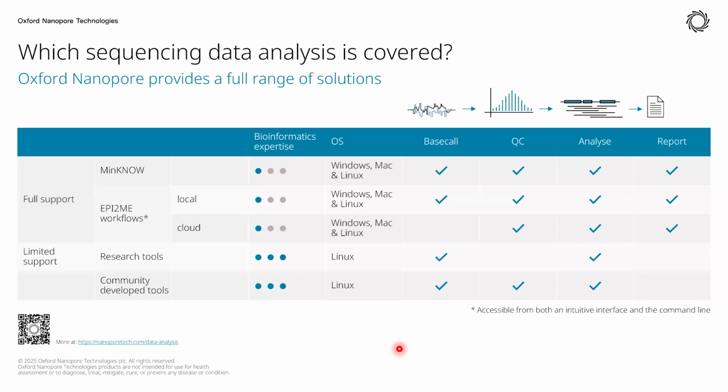So what is the software that we have to run on the raw data in order to know that Chris has these cells and these counts for these genes? This is the question. Okay, and by cells, is this a single cell approach? Whatever. Sorry. If it's not cells, if it's bulk, whatever it is.